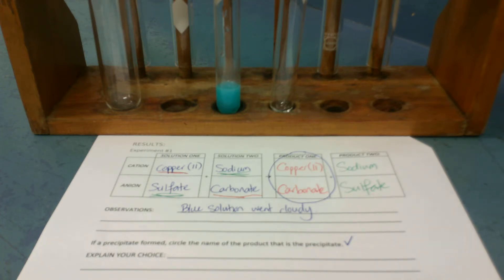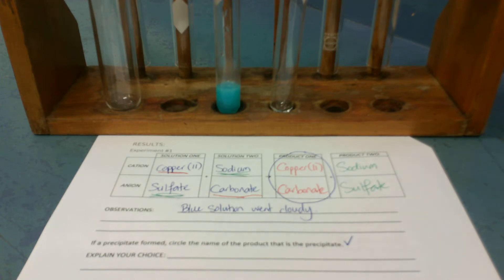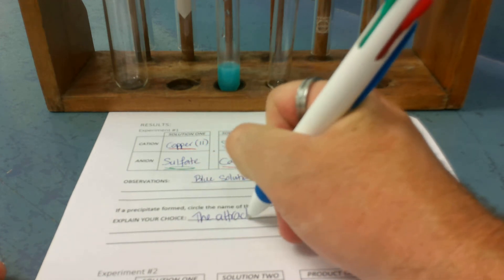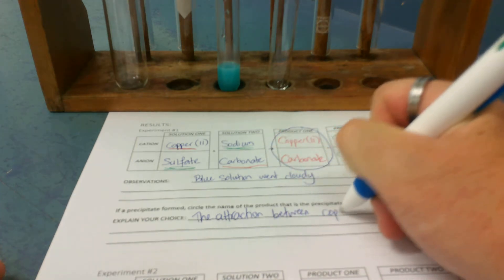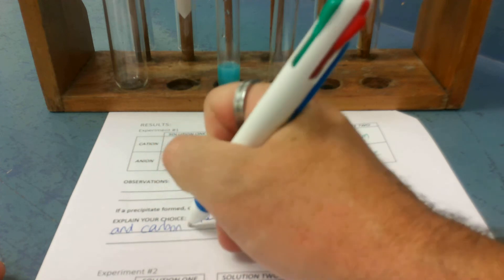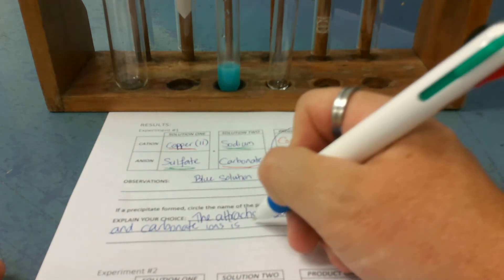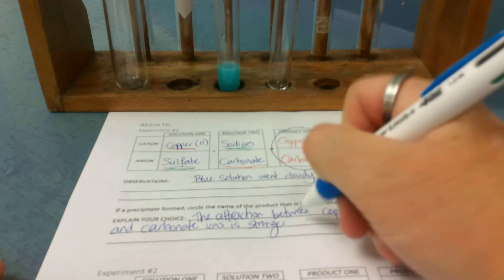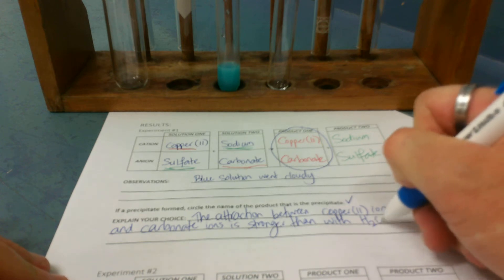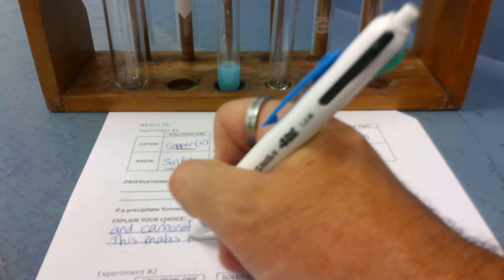Now, if you want to go more science-y on this, it is because the attraction between the copper ions and the carbonate ions are stronger than their attraction for the water. So they're not going to stay in solution. So I'm going to give you the really fancy answer written on here. The explanation is, the attraction between copper-2 ions and carbonate ions is stronger than with water. Now, what's the formula for water? H2O. We're going to be chemists now. Let's use that symbol. With H2O.